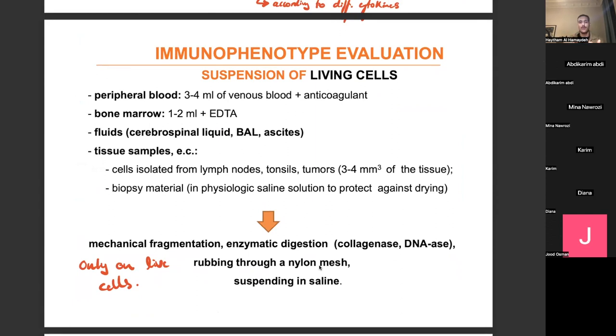The actual core of the presentation starts. Now we know the markers on the cells. And we will now dive into the different ways in which scientists are able to isolate cells, put them into groups, and look at them on graphs, and separate them by what markers they have and don't have, their size, their granulations, their functions, etc.